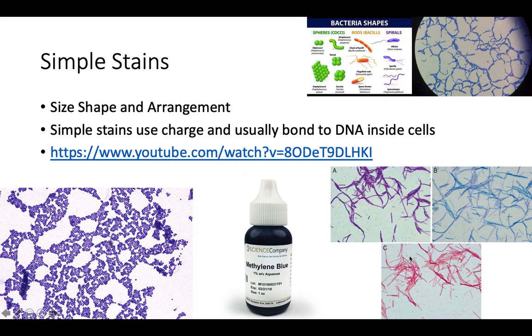Also, a lot of beginner courses start with this for microbiology just because it's pretty easy to do. There's not a lot of complicated steps inside of this. A lot of simple stains like methylene blue are going to bond inside of the cell to cellular DNA. Crystal violet will bond to peptidoglycan. It just kind of depends on the dye that's used, on this one stain that you select. That's why it's called a simple stain, because it is one single liquid. And all you get from this are size, shape, and arrangement. You don't get gram reaction, which is the most important part of staining because that allows you to continue diagnosing what type of infection or bacteria your patient has.